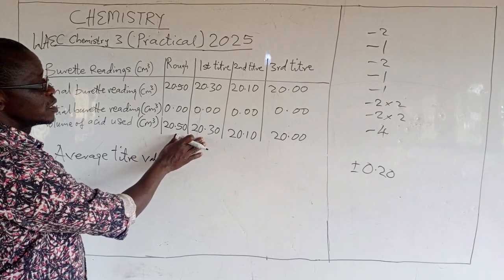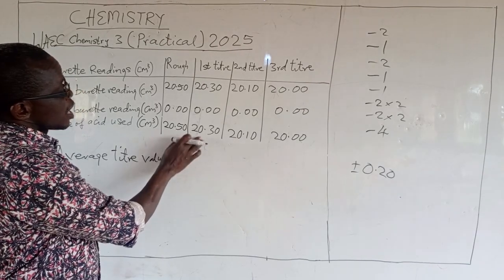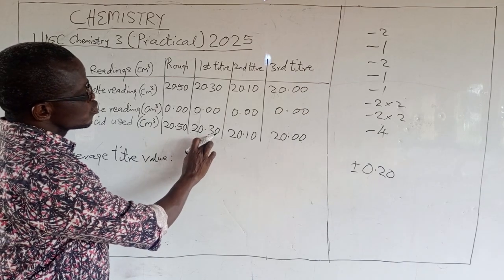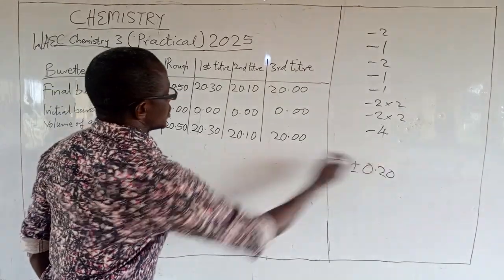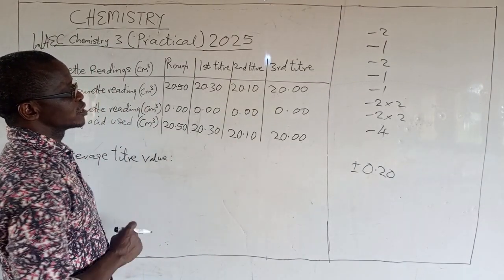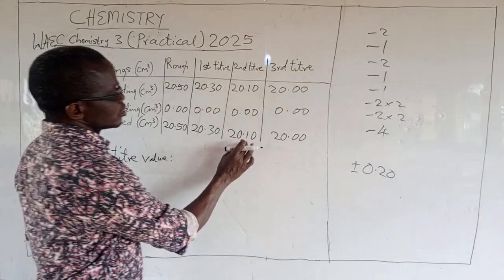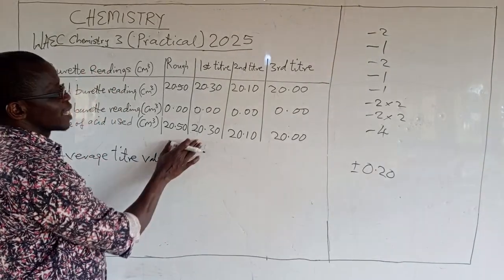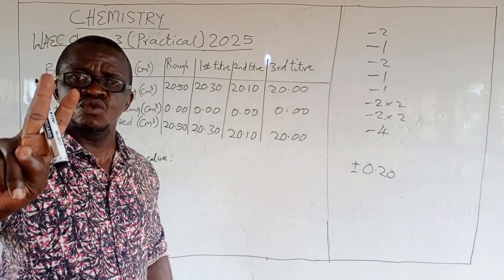I can use this. Now, if I am not too sure of my rough and I want to leave that and use these two, let's see. When you remove 1 from 3, you have 2. So they are concordant. These two are also concordant. I can use the 2. Now let me see if I can use these two. 1 and 0, they are concordant. I can use this, I can use this, I can use this. But that is when I am using 2 sets.